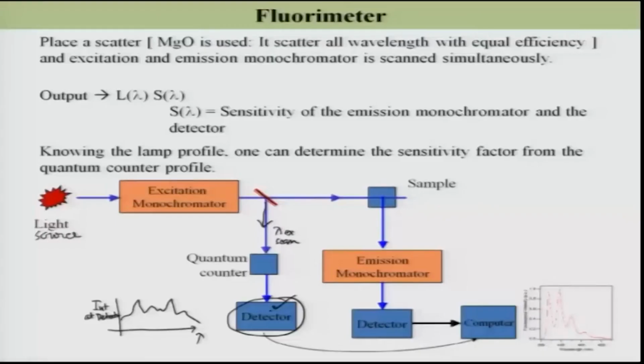So, welcome back after the break. I was discussing this quantum counter. In this quantum counter, my aim is to get the corrected emission spectra.